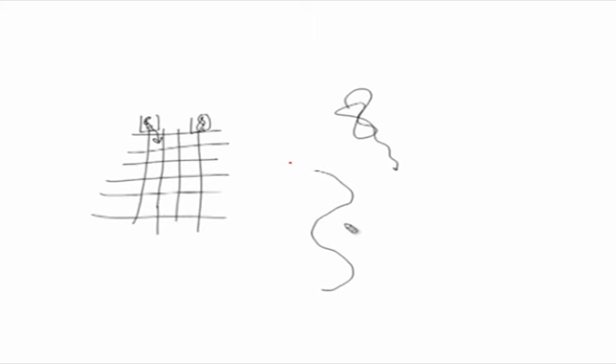Now, when molecules above 20 kb move in this agarose gel, after a very short while, as the leading front goes and the rest of the DNA follows, they become entangled in this meshwork, so entangled that their movement is impeded. They are not able to move further.